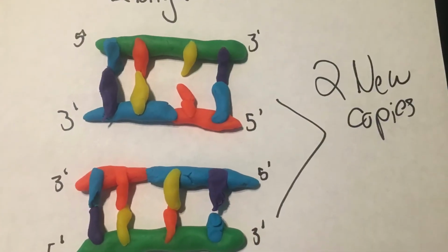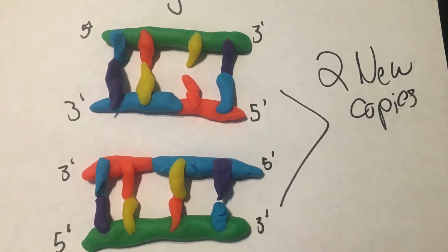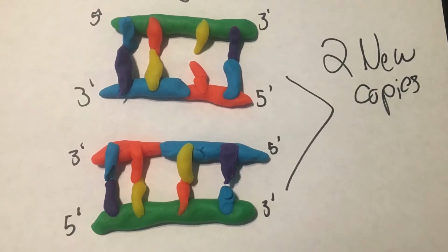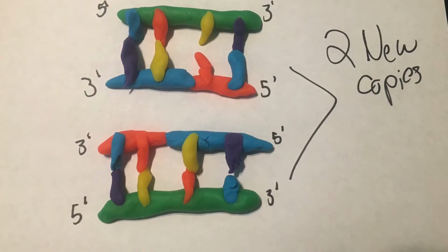Finally, in elongation, a heat-tolerant enzyme called DNA Taq polymerase copies the strands, producing 2 new copies of the original DNA sample. After doing this process 30 times, we would have a total of 2 to the 30th copies of DNA, which is plenty enough to use. So we have the DNA to work with, but how does that tell us who killed Anna Garcia?